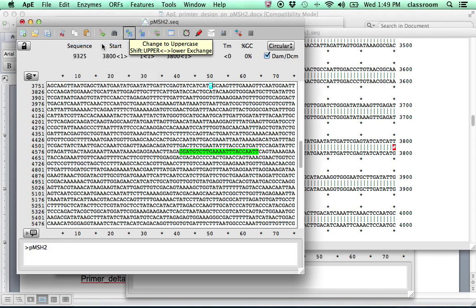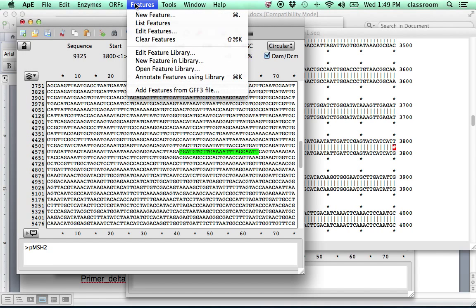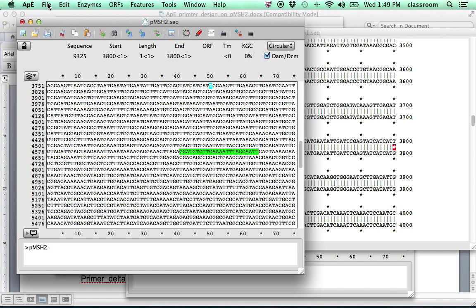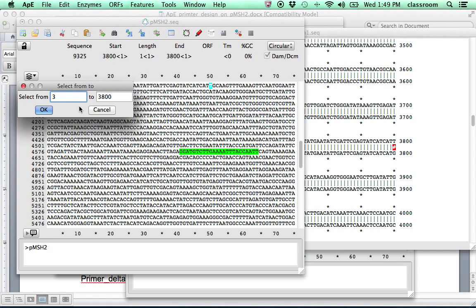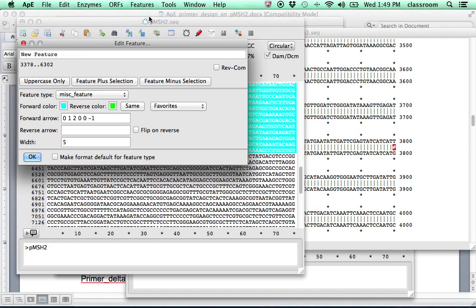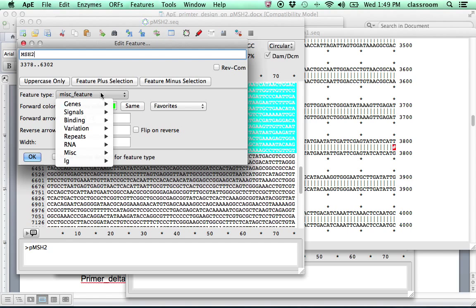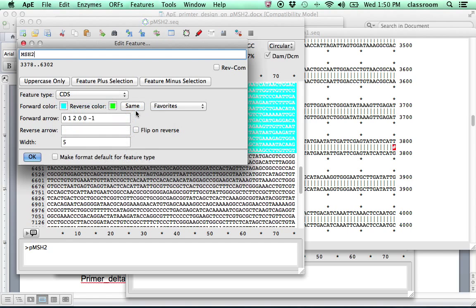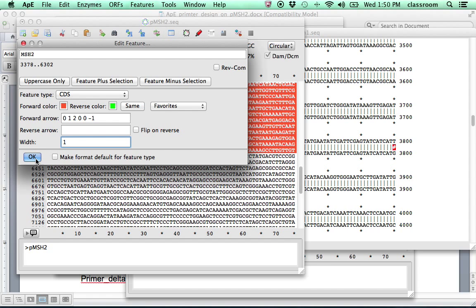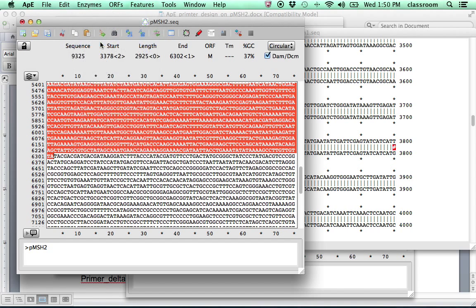This time, if you do the map, you will see the unknown mutation right there. Now, it's probably nice to also put the MSH2 coding sequence there. So I need to first select. So the MSH2 coding sequence is 3378 to 6302. We have a new feature, which is MSH2 coding sequences. Gene CDS for coding sequences. I'm going to make this a little smaller. Width. Make this smaller. And the color, I'm going to pick the red.